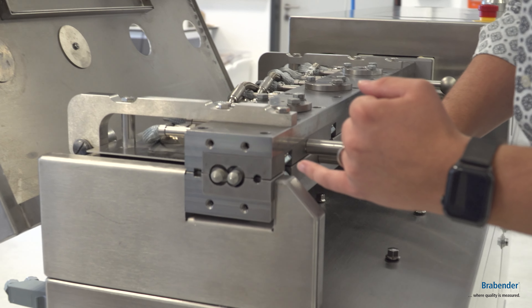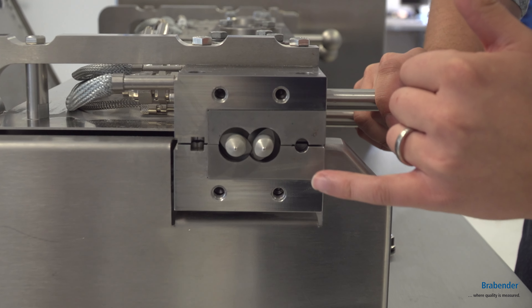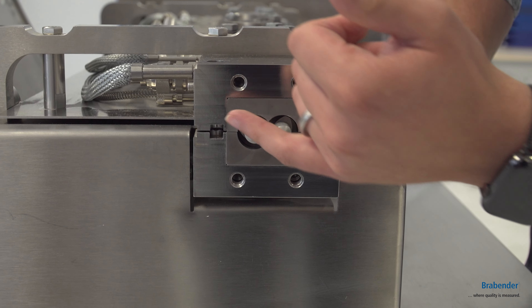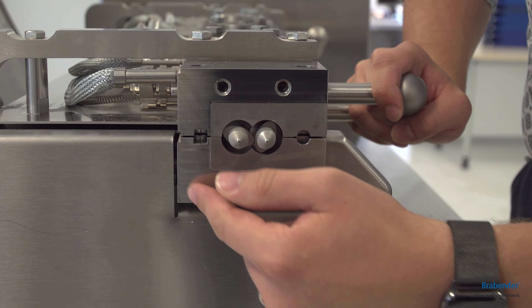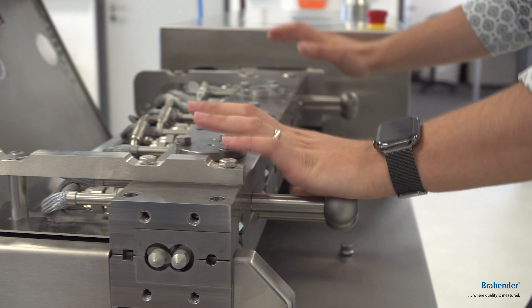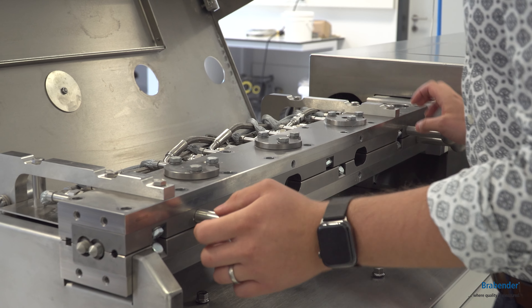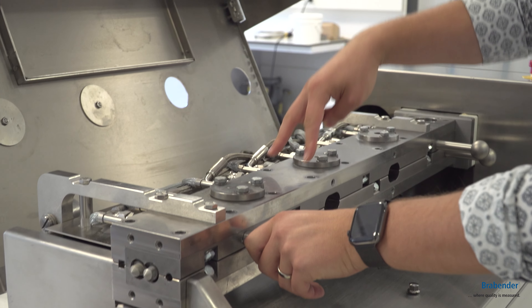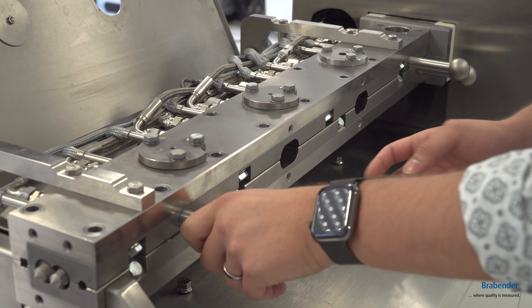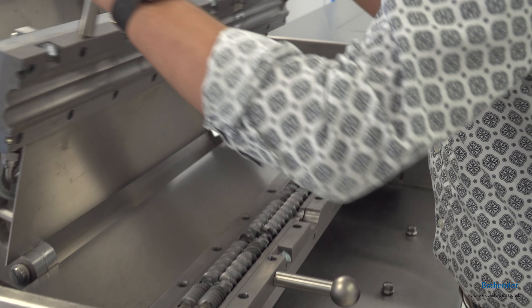When you look very closely to the top of the system you will recognize two different metals. These two parts here are our so-called liner and these parts here are the liner carrier. Our compounders are famous for the clamshell design, which means that by removing these screws here and the side dosing bolts you can open the whole system like this.